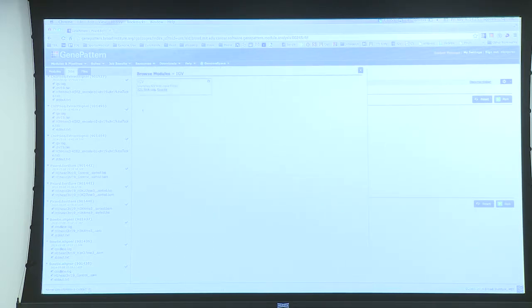So if you click on IGV, it says launches IGV with the input files. So I click on it. And in general, this is more relevant to RNA sequencing, but it's also nice to do it with ChIP sequencing. It just takes a bit longer here. Let's see.